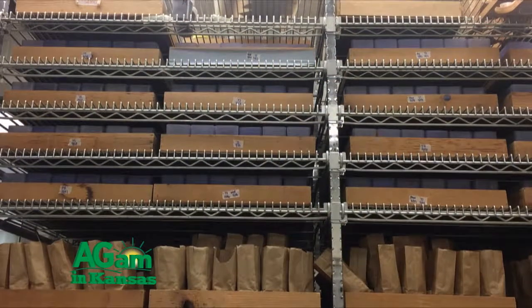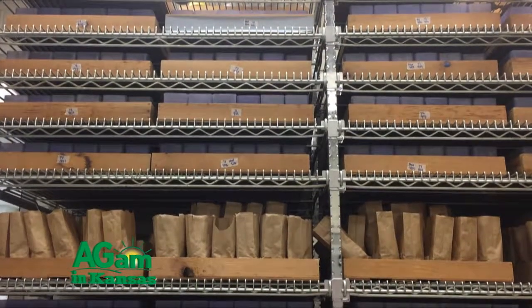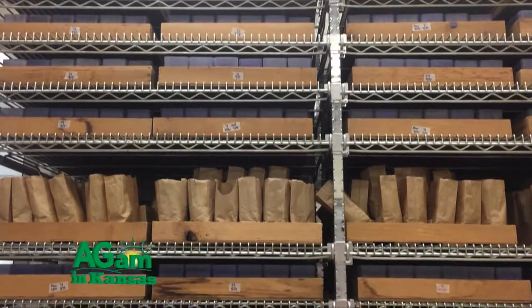But also, we are sending an electronic report via email. So as soon as the results are ready, we provide the recommendations. We review the recommendations, make sure they are accurate, and then immediately we send it via email. That way, that's available to the producer immediately, basically. Again, we can also provide the reports via regular mail, but more and more, we don't have many people requesting that. You keep the sample on hand for 2 or 3 months?